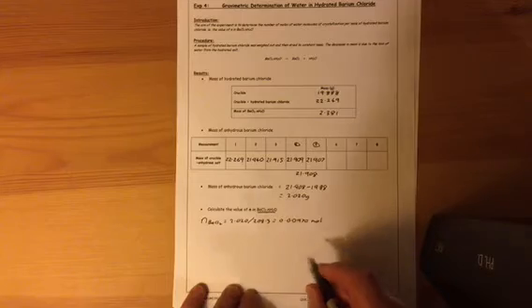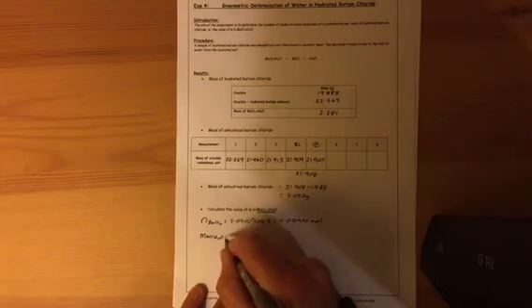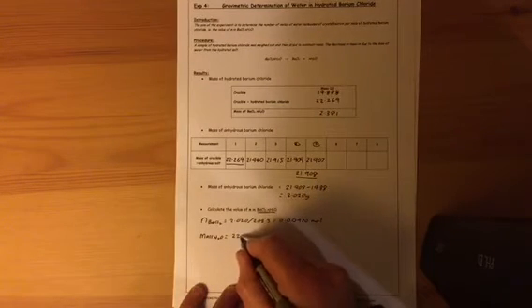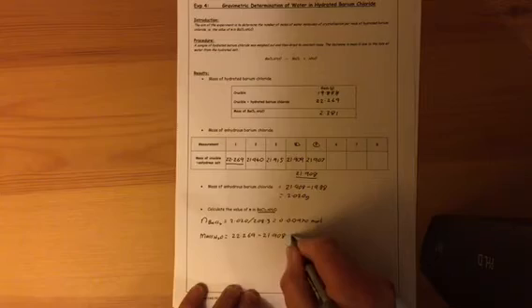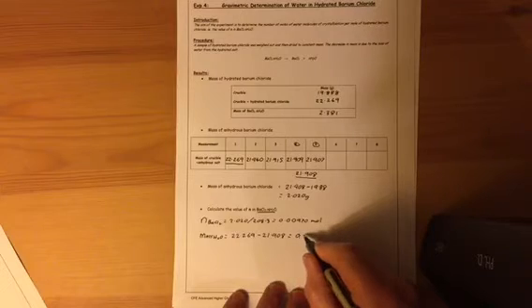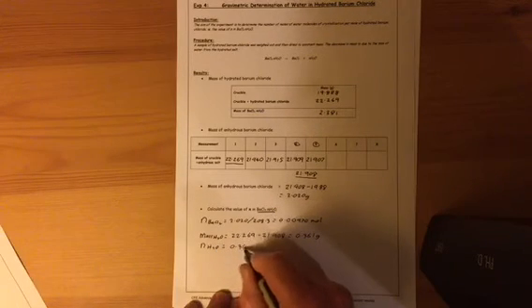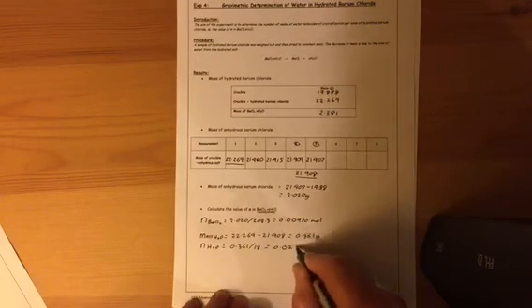Now, the number of moles of water, well, first thing we have to work out is what mass of water we had. So the mass of water is the difference between that value there and that value there. Okay, so it's 22.269 minus 21.908, which equals 0.361 grams. So the number of moles of H2O is 0.361 divided by 18, which equals 0.0201 moles.